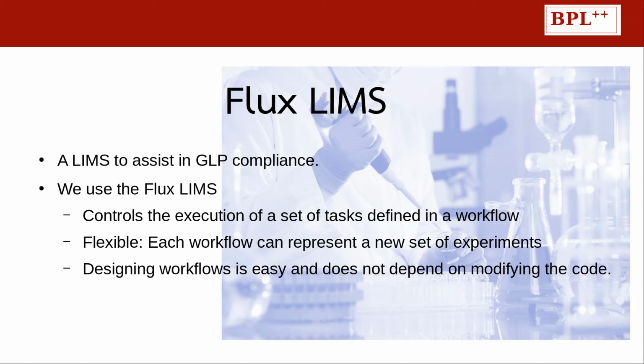BPL++ is a LIMS designed to assist in GLP compliance. It uses Flux, a workflow-based LIMS that allows experiments to be modeled in workflows, where each experimental step is a workflow activity. It is very flexible. Flux can manage different experiments by using different workflows. Moreover, designing workflows is easy and does not depend on modifying system code.